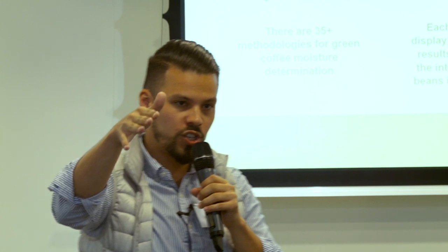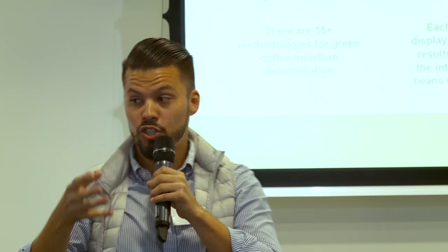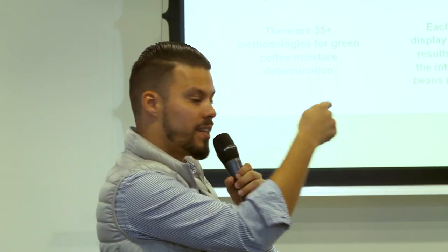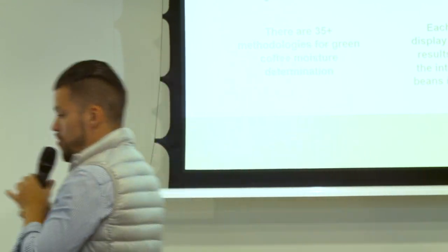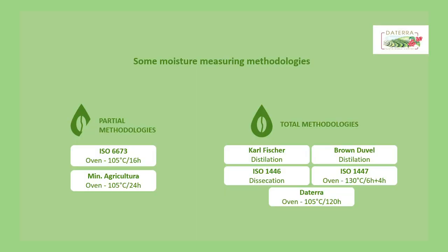So you have the electronic moisture meters that are actually calibrated to one of those oven tests. And there's nothing wrong with that. The only thing you have to do is know what the methodology is. So just so you have an idea, those are the most common ones.